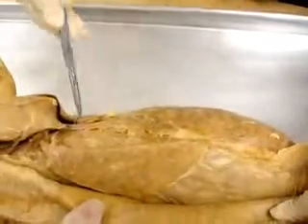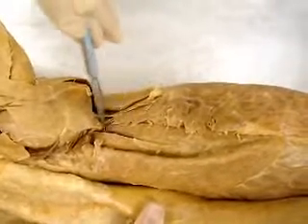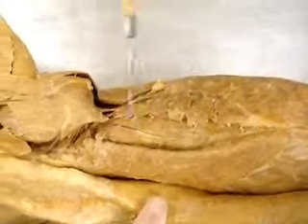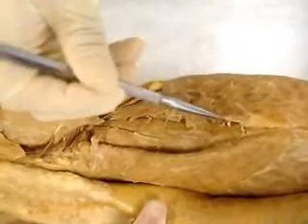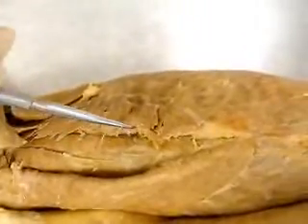Starting from the dorsal view of the cat, underneath the latissimus dorsi, here we have the spinalis dorsi, and then this is longissimus right here, and then these are the serratus dorsalis. If you go underneath them, that's where the iliocostals are — you just can't see them too well in this one.